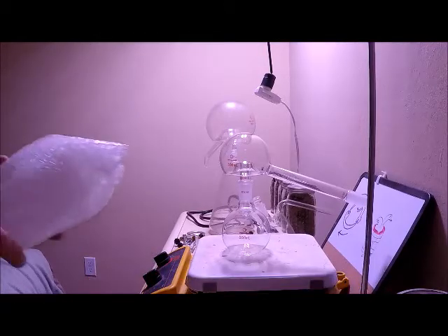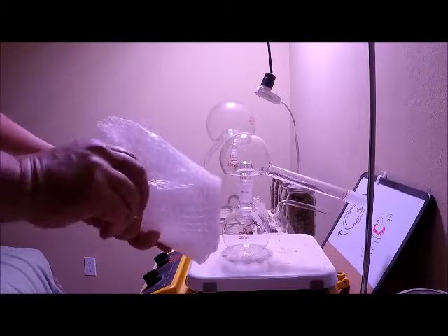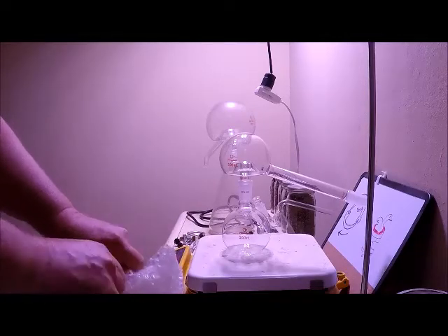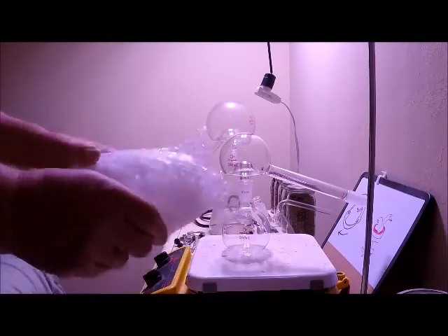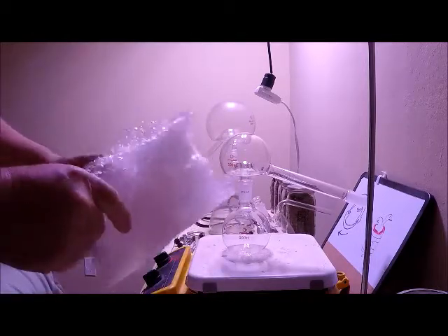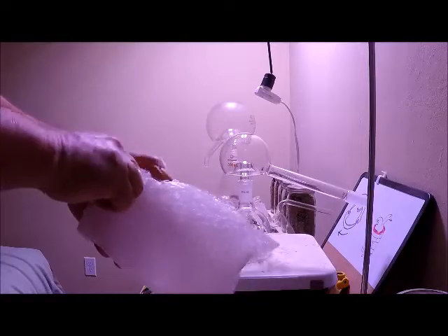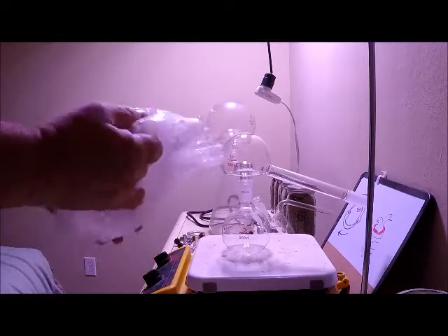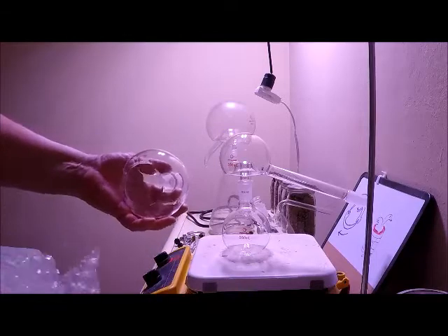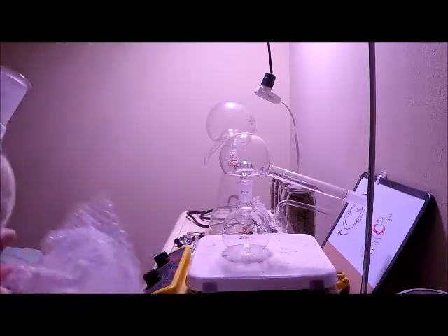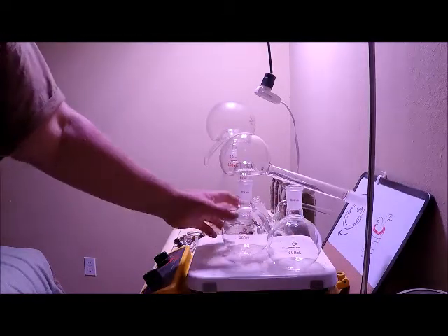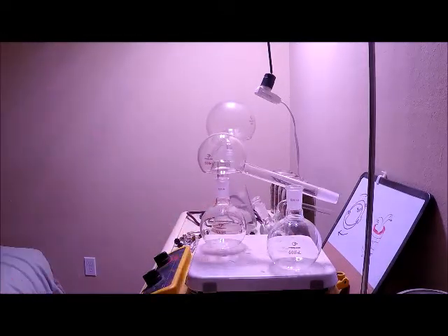Now the second package. The second thing that was in that package. Another 500 ml flat bottom round flask. That's going to be the receptacle.